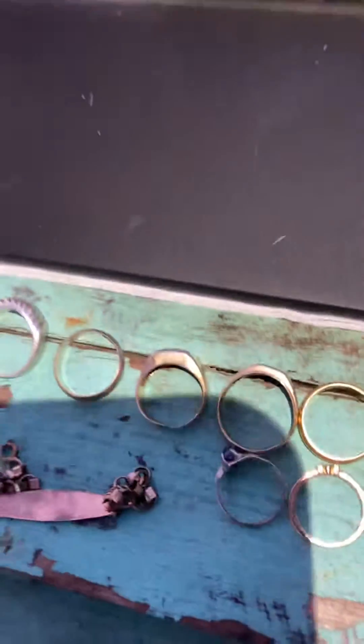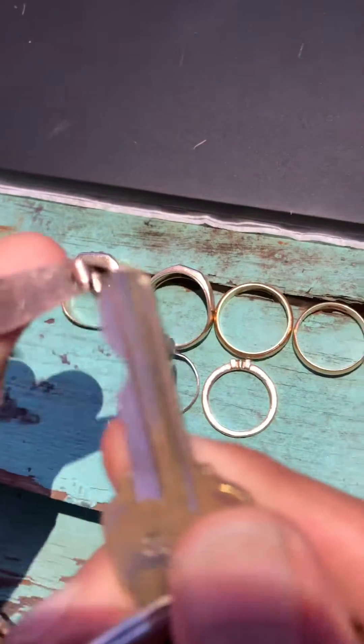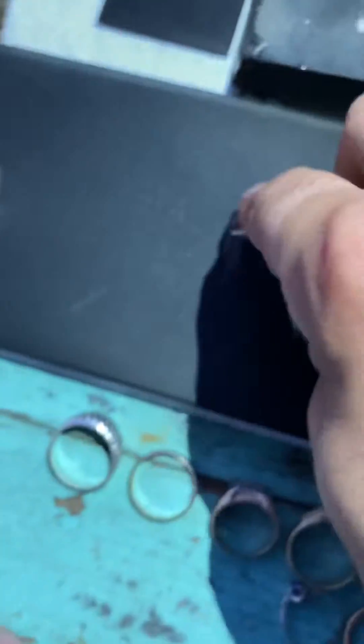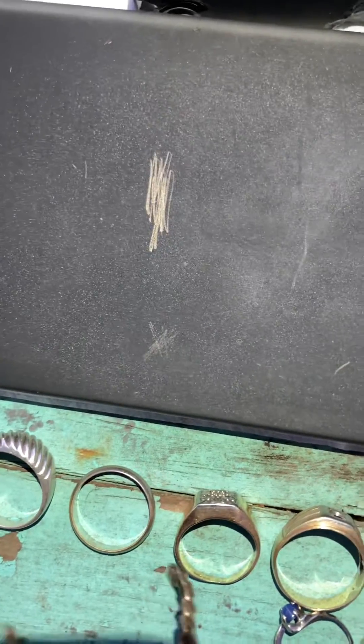Here's yellow brass for comparison. 8 carat gold is 60% copper and 33% gold. Here is the piece — I'm going to scratch it now.